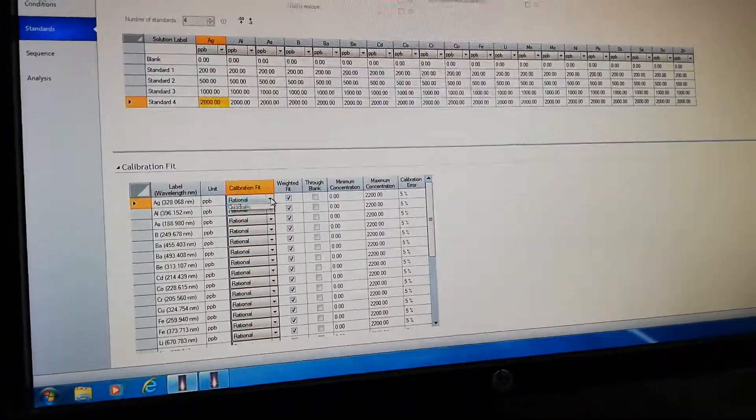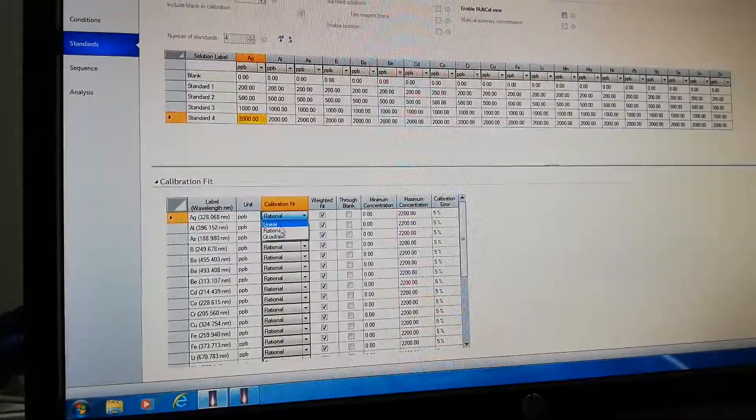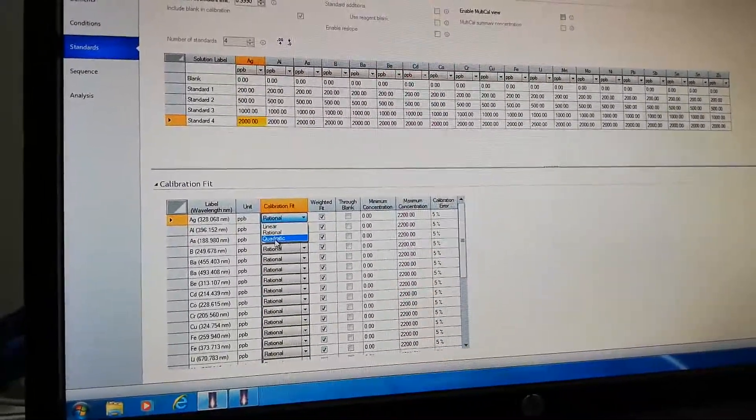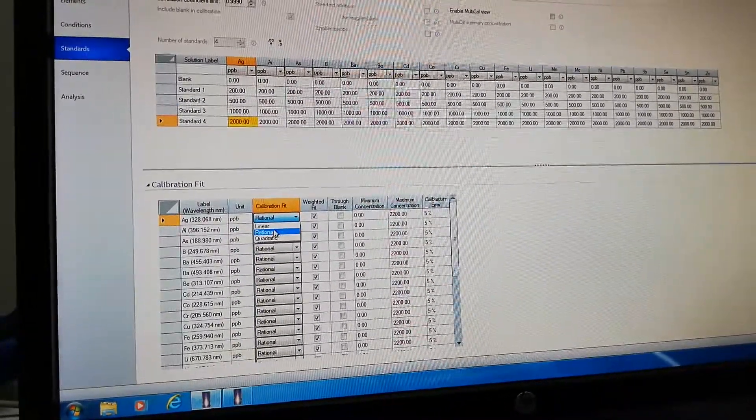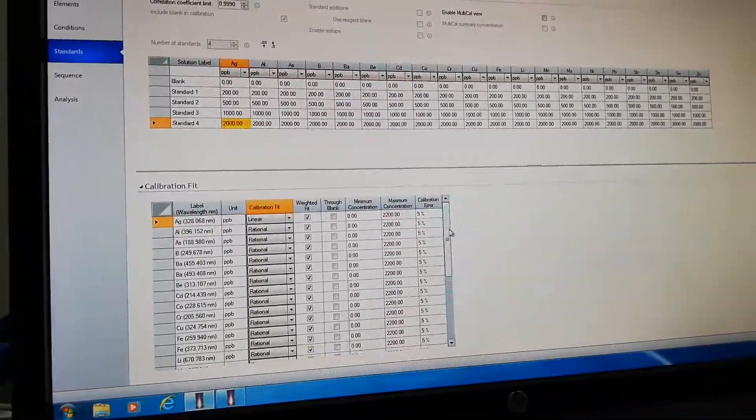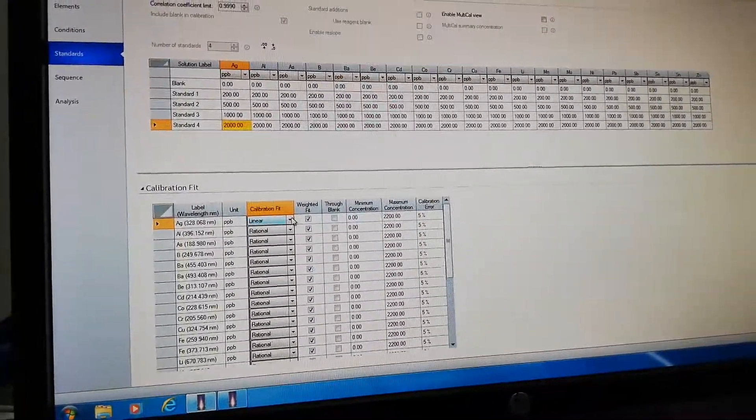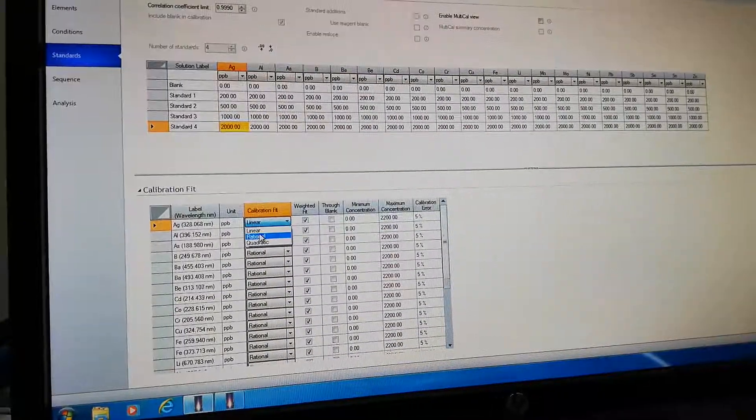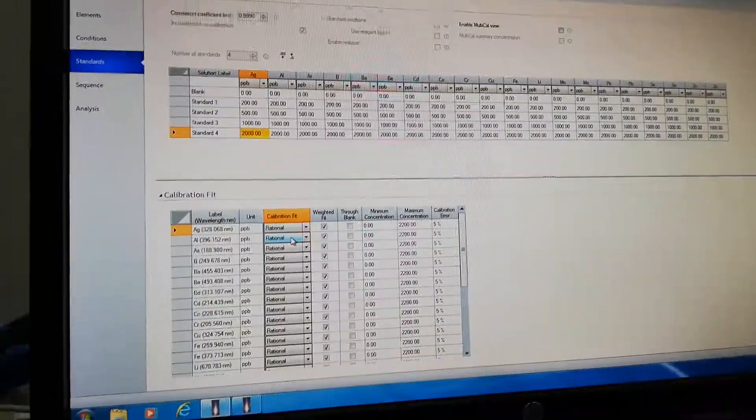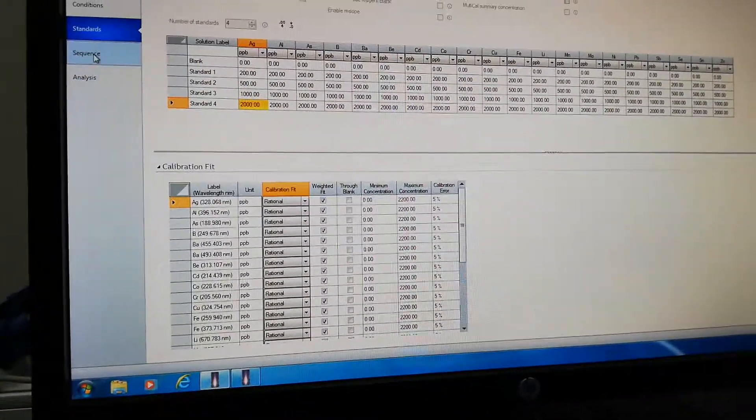Then here is the calibration fit selection: linear, rational, quadratic. It depends on what type of calibration fit you want.